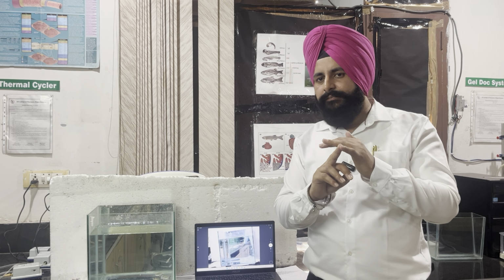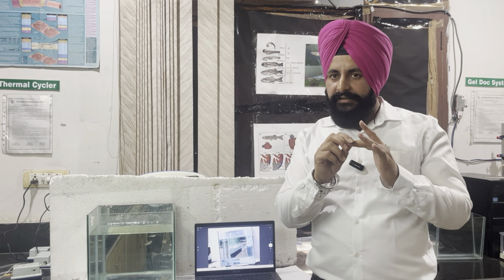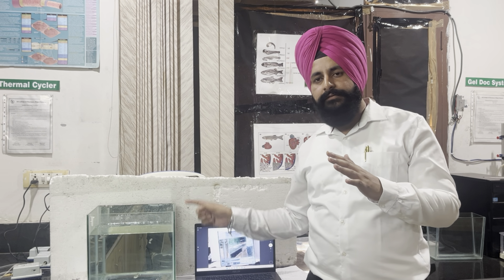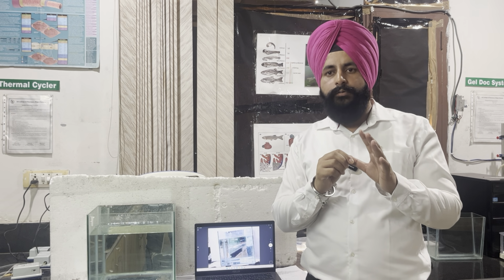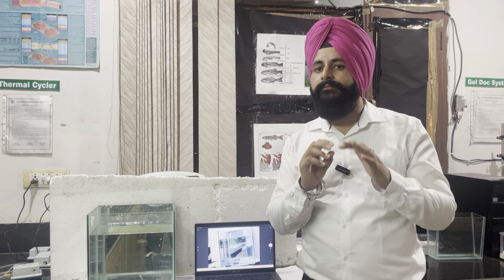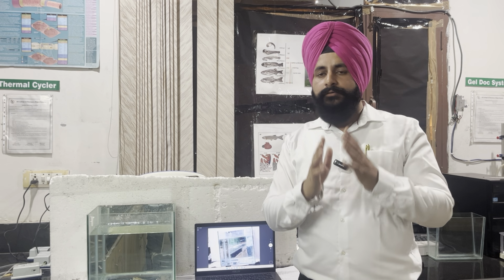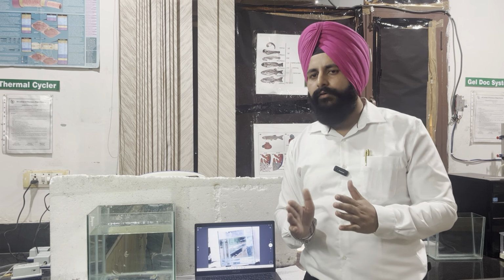I will explain again. First thing, you will check the movement of the fish at the bottom zone for at least 5 minutes. The second thing, you will check the striking behavior of the fish with the wall. The third thing, you will check the movement of the fish from bottom to top along the wall side. The fourth thing, you can check the diet intake. And the fifth thing, you can check the gasping behavior, that means opening the mouth, because the fish feels hypoxia. So dear friends, these are the two models: the acute model of anxiety and the chronic model of anxiety.